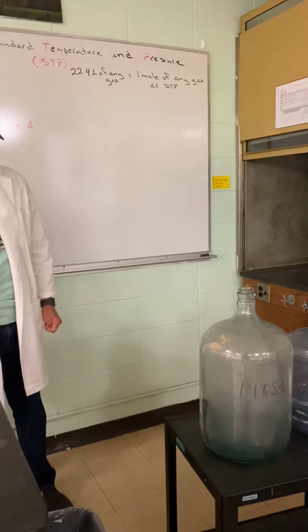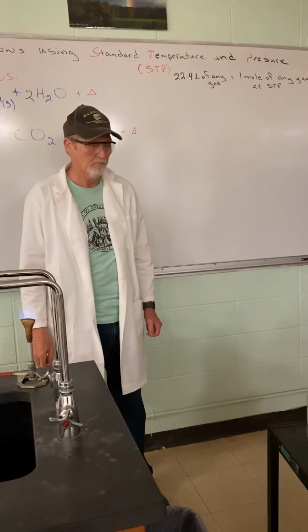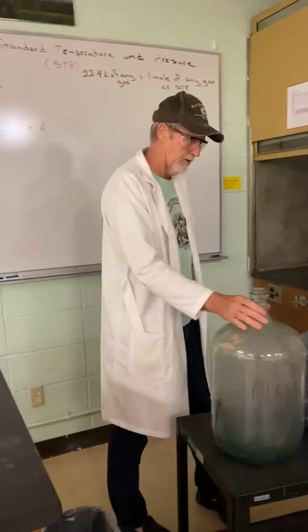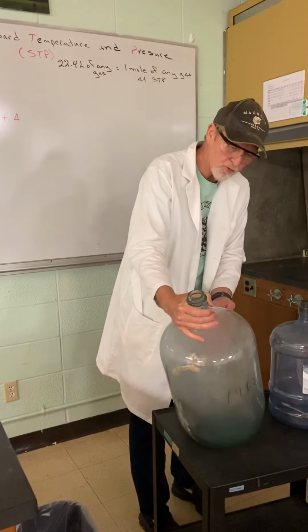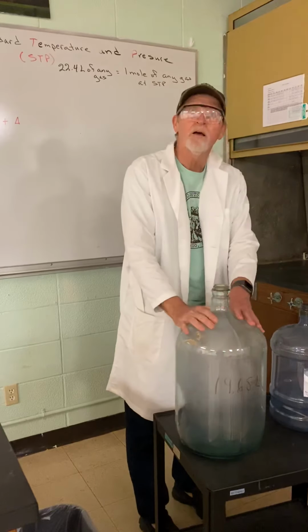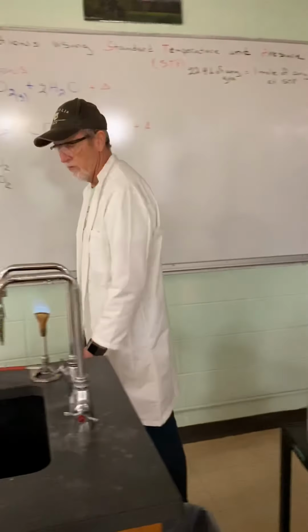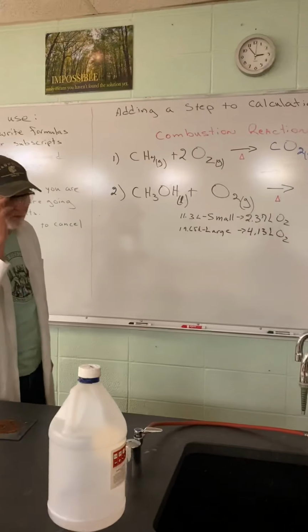Nothing. Larger container. Maybe I just didn't get as much in there. Well, it has worked before. Obviously not this time. Let's try a little bit more with our reaction here with the stoichiometry, and then we'll be done for our lesson today.